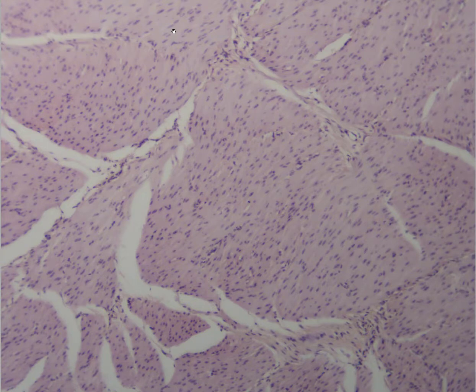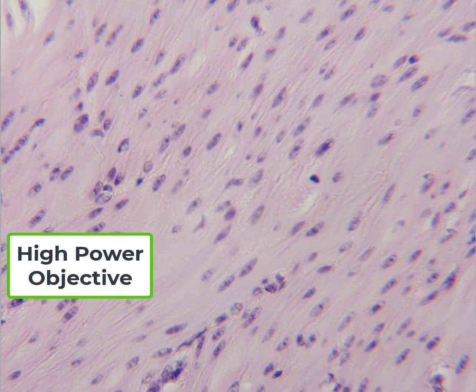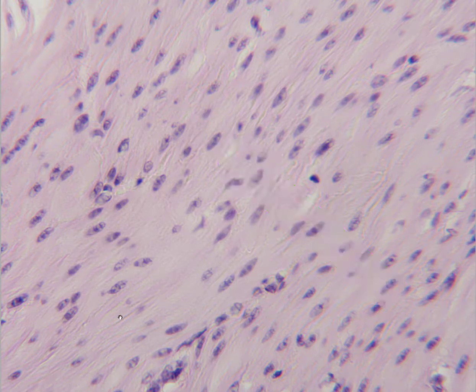So now what I'm going to do, I'm going to zoom into our high power objective. Give it a little refocus here, and voila, there they are, nicely in focus. And I have magnified this a little bit on the screen so we can see a little bit better here. And we can see these sort of tapered cells with these nuclei. Most of them, you can see the nuclei within them. You can see the cytoplasm that surrounds the nuclei, and of course you can sort of make out these cell membranes as well. You can see the cell membrane. That would be the border around this thing.